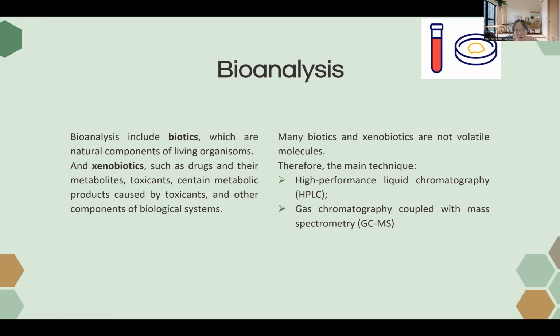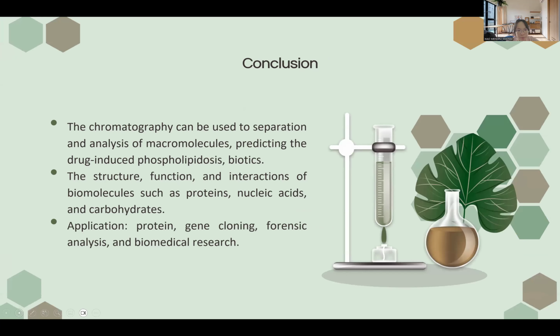The main technique for bioanalysis is high-performance liquid chromatography, and the limitation of GC utilization is caused by the fact that GC is applicable only to volatile samples. However, GC coupled with mass spectrometry as detection is also a very useful technique in bioanalysis.